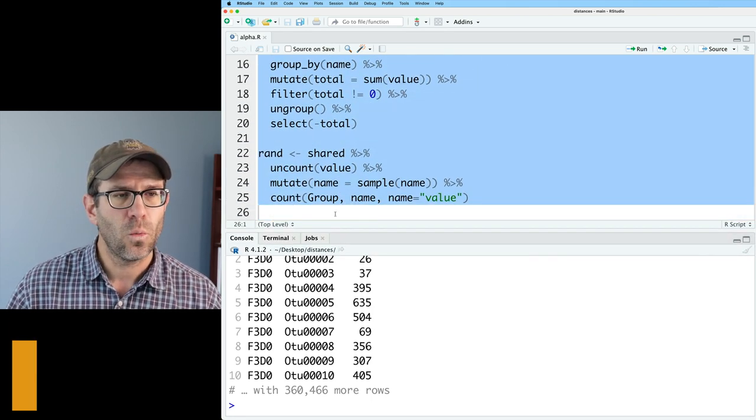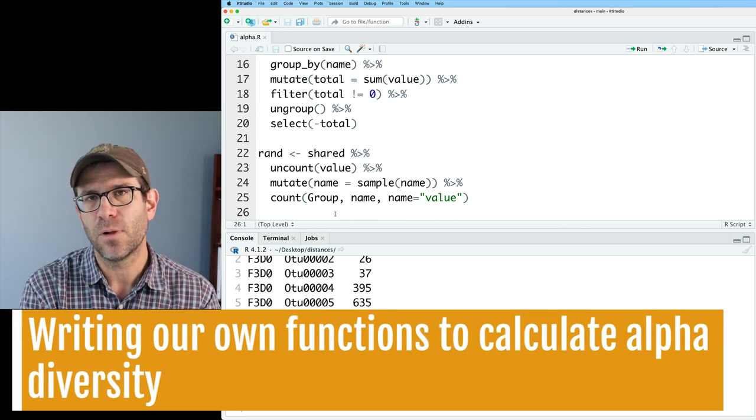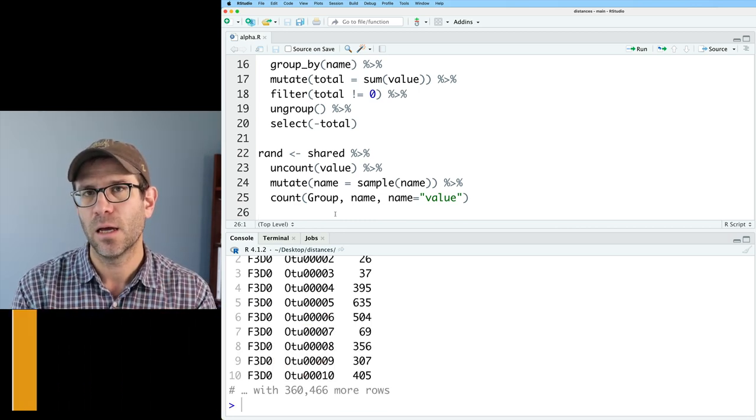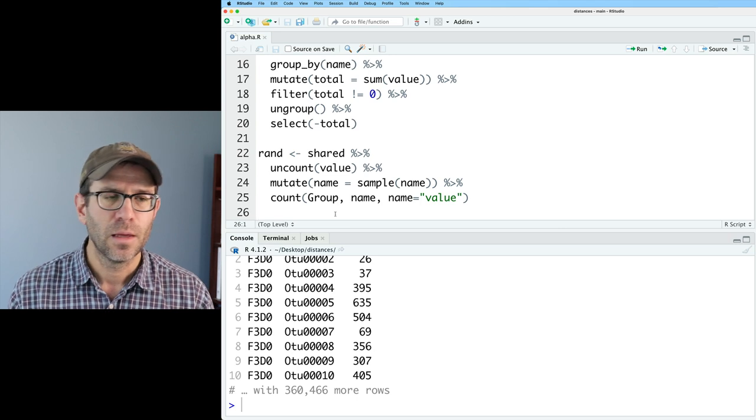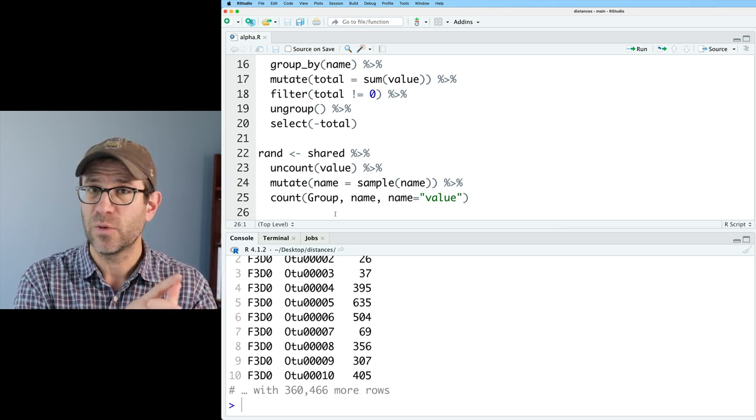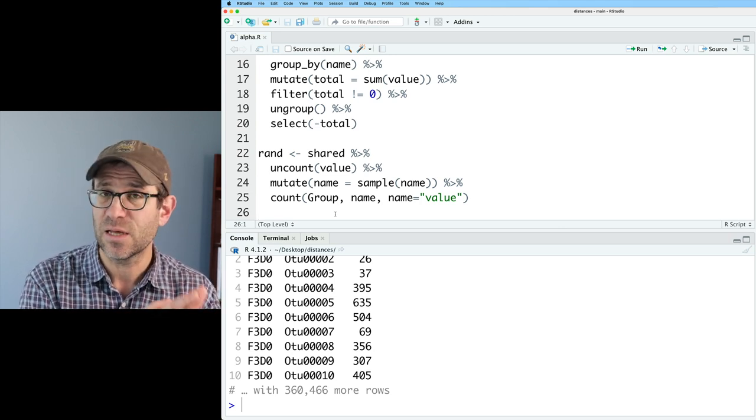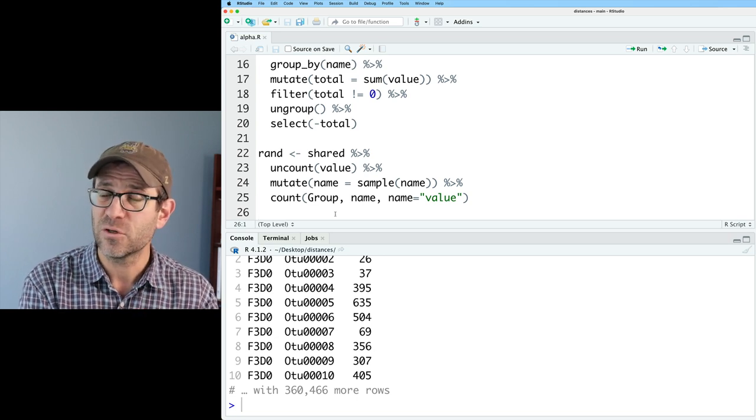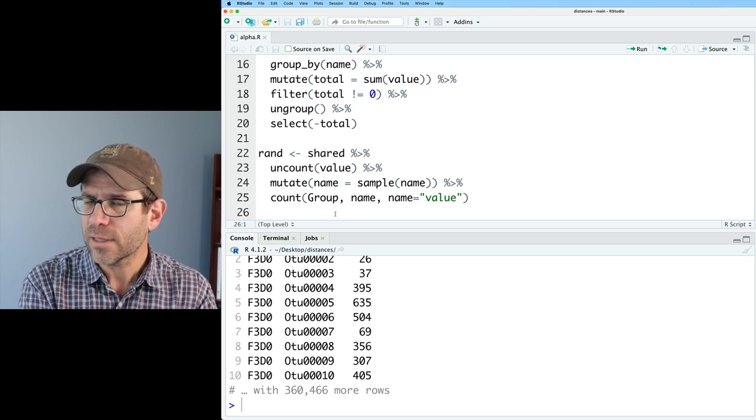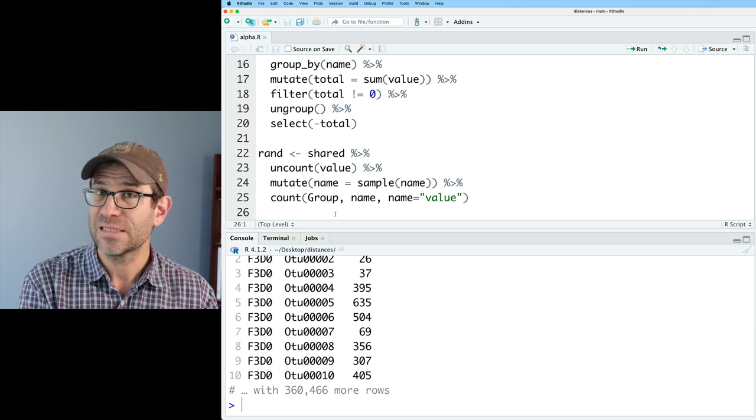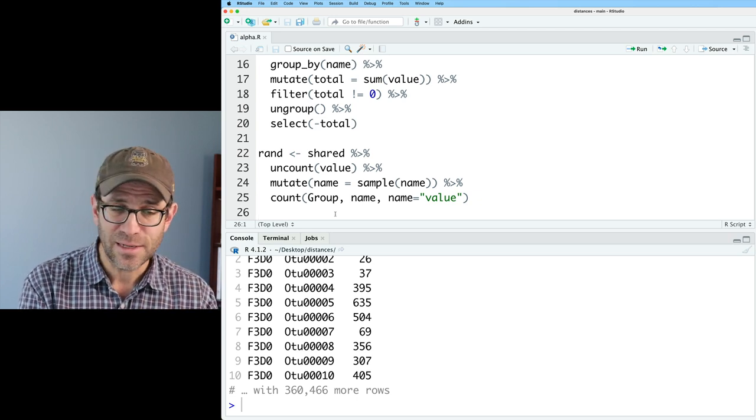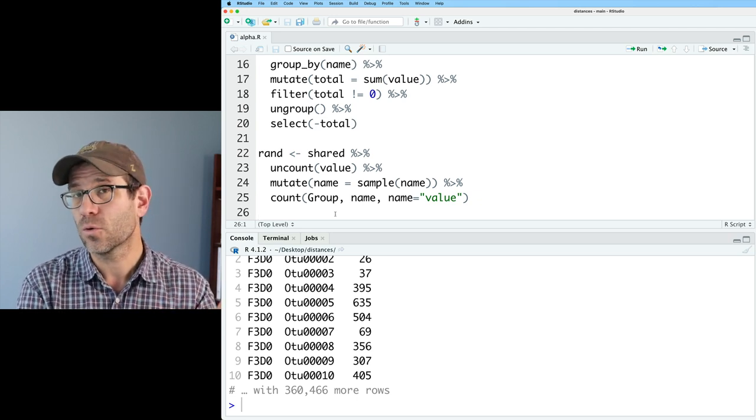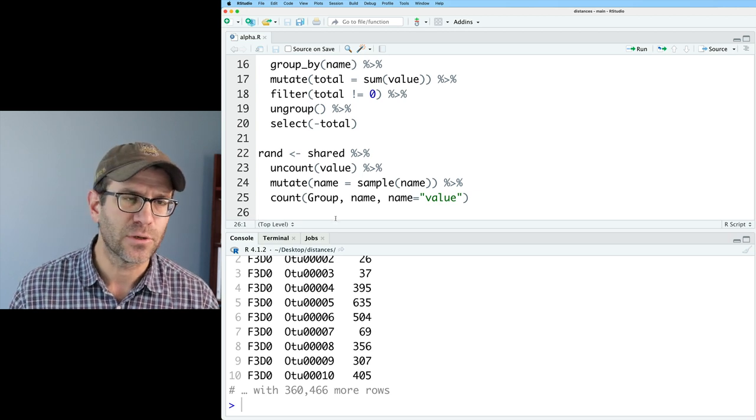So what I want to do is for each sample, I want to calculate a variety of alpha diversity metrics. I would like to calculate the richness, the total number of taxa that we saw in each sample. I want to calculate the Shannon diversity index, the Shannon Weaver index, it's sometimes called. I want to calculate the Simpson index, the inverse Simpson index, and then we want to know the total number of individuals in each of our samples.